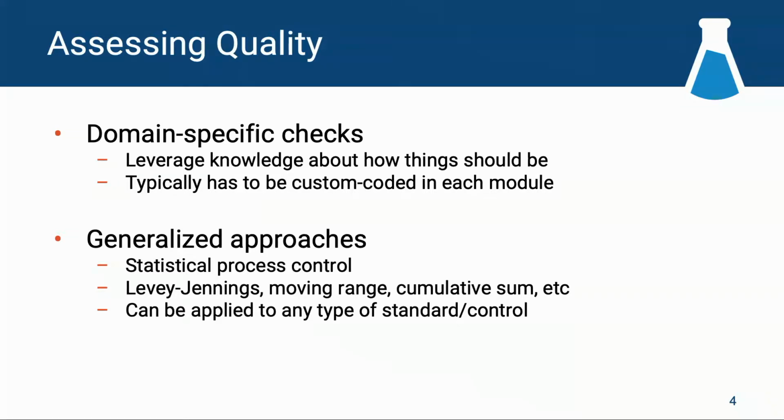And so I'll talk more about the specific plot types in a minute. But really, these are designed for something that should be consistent. So you're running a QC sample, say the first run of the day on the instrument, or every 10th run, or some regular cadence that allows you to know that your experimental results can be trusted because your instrumentation is working well.